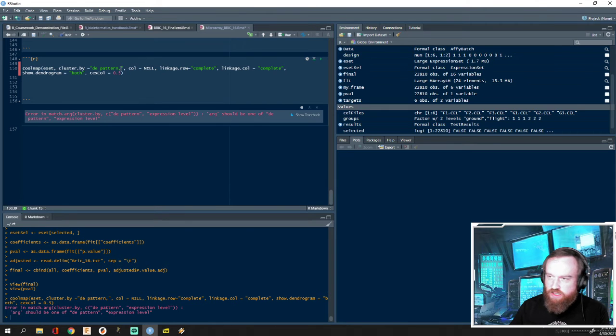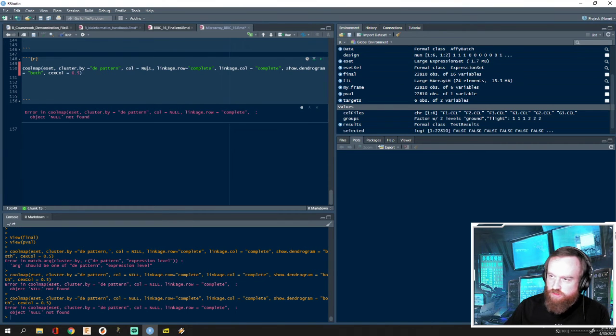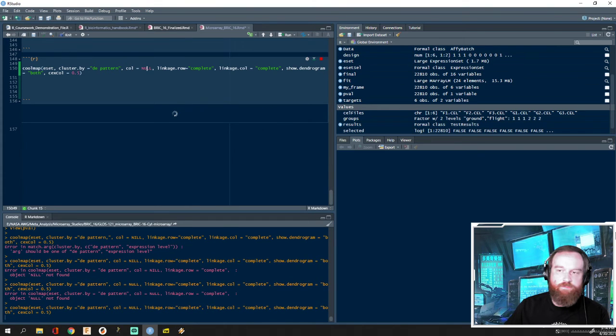Oh, no comma here. Okay, let's try this one more time. Null. And how about with an uppercase U? That's what happens when I rush. Okay, so like I said, this is going to take a little bit of time, but I already have it done.